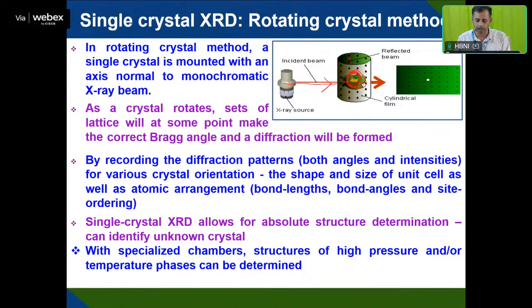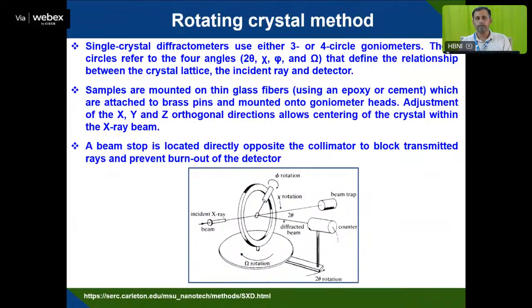Single crystal XRD allows absolute structure determination. You can identify an unknown crystal through single crystal XRD. With a specialized chamber, you can do high pressure or high temperature experiments. You can identify the different phases formed during heat treatment or pressure treatment by single crystal XRD.